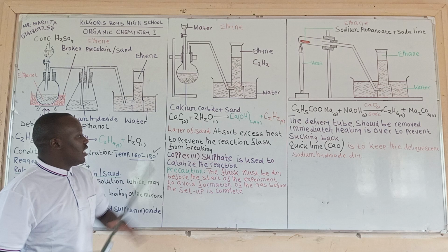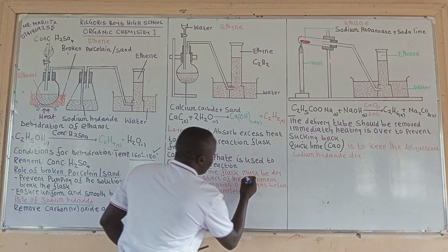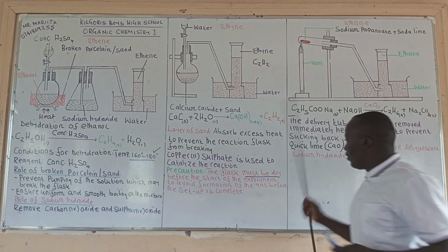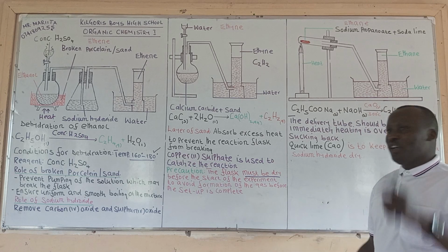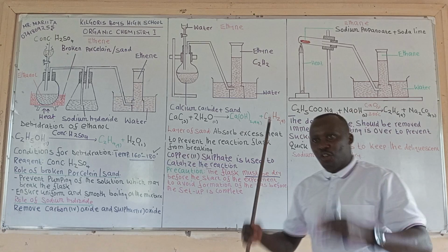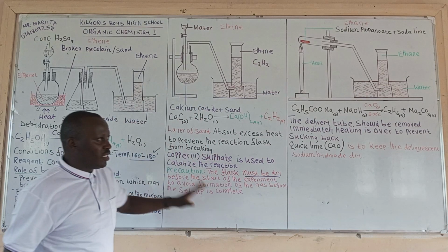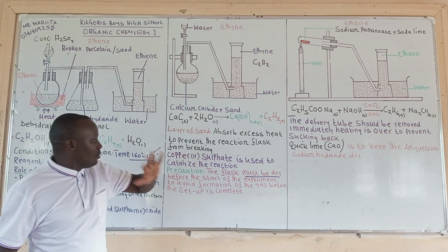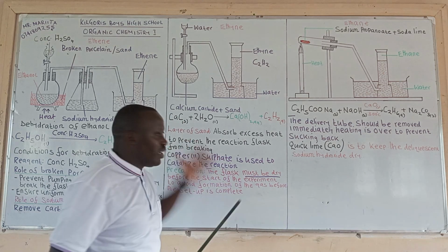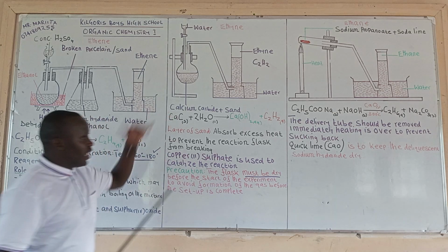In this experiment, the flask must be dry before the start of the experiment. That is a very important precaution, to avoid the formation of the gas before the setup is complete. So the equation of reaction is that.